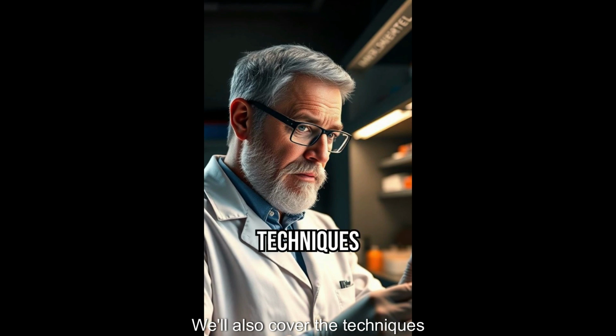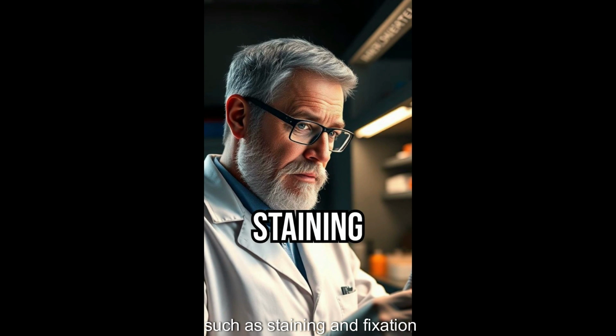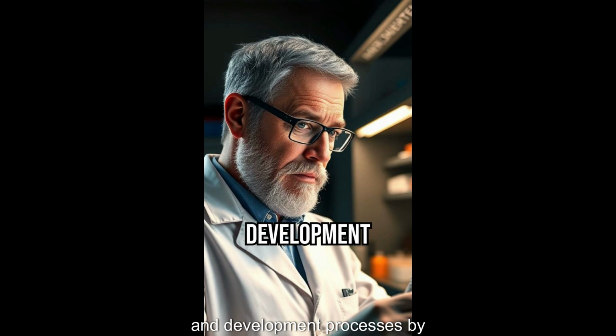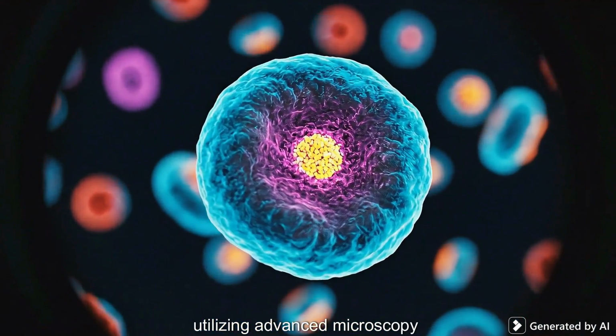We'll also cover the techniques used by scientists to prepare slides and samples for observation, such as staining and fixation, which enhance visibility and detail. These methods have transformed how we understand cell biology, disease mechanisms, and development processes, by utilizing advanced microscopy techniques.